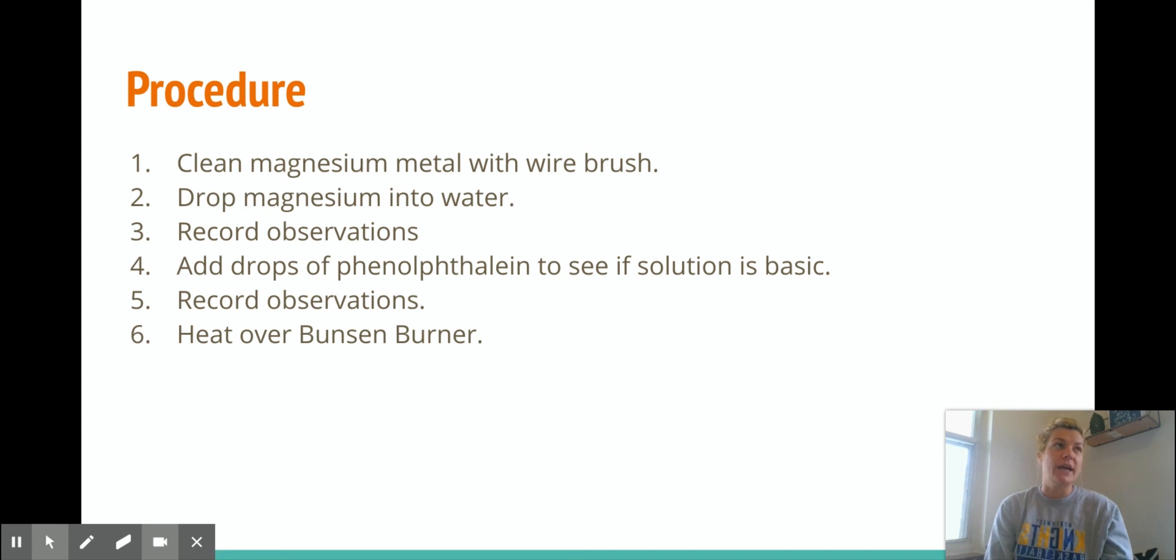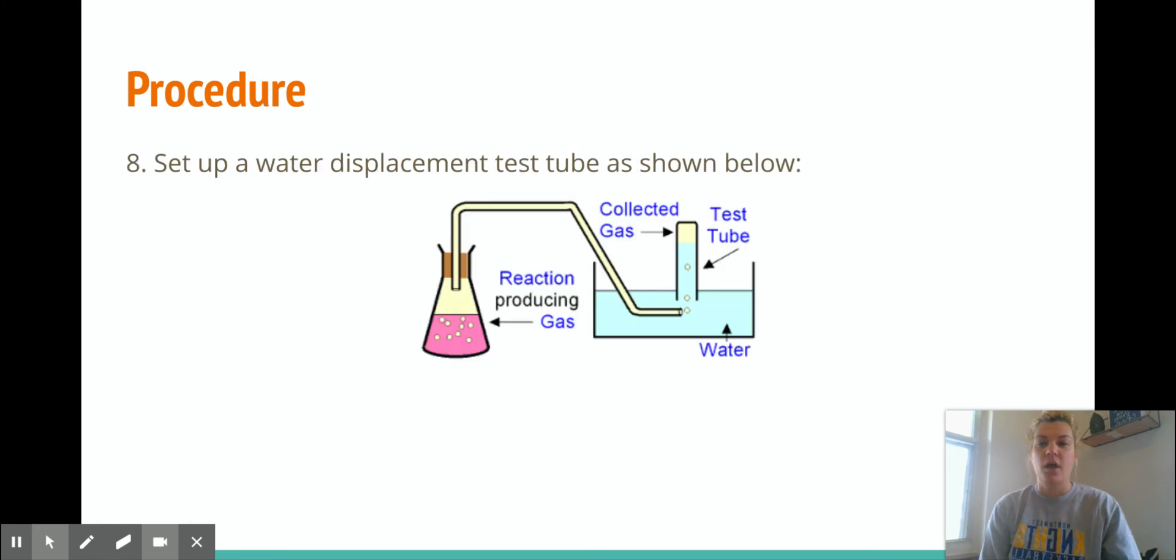And then we're going to see that since this reaction is so slow, we're going to have to heat it over the Bunsen burner to speed it up. And he talks about why that is. It's because we're making the molecules move faster and interact with each other more, and that's why the reaction can go faster once heated. And then we're going to record observations.